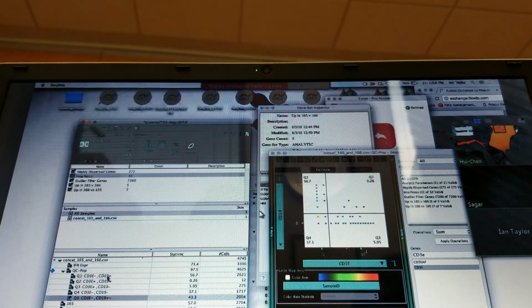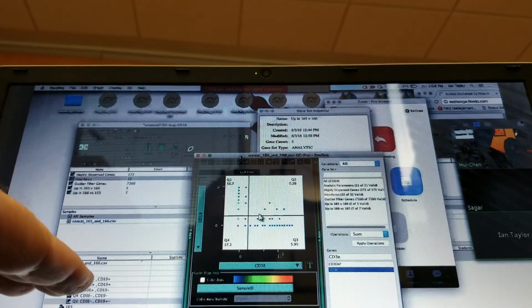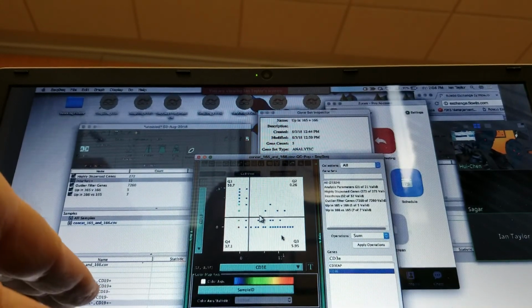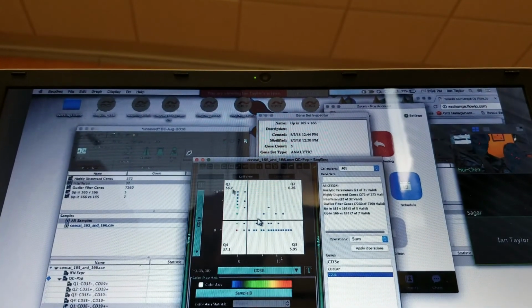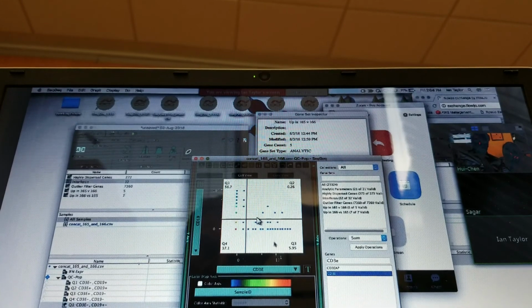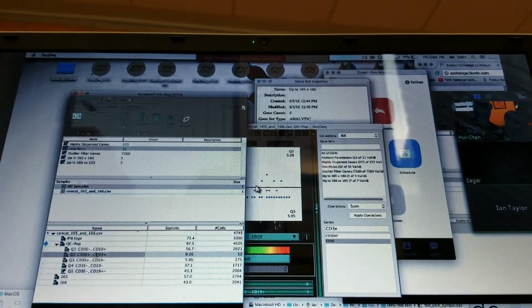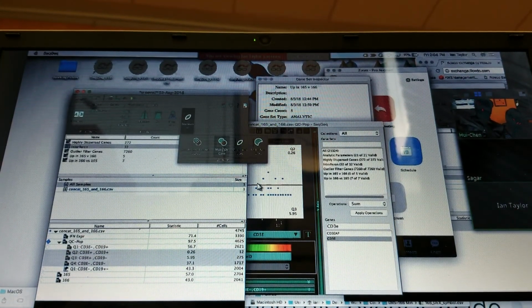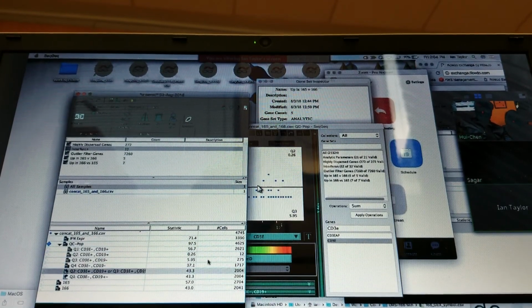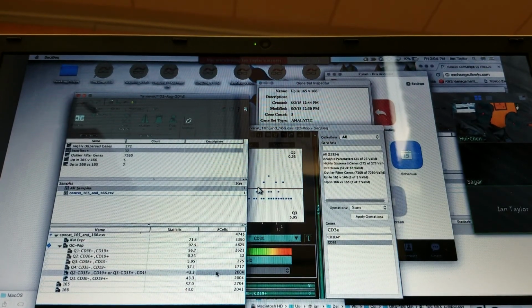Why can't you just do Q1? You don't need the NOT gate unless you need it. You got Q1 there. Q1 is CD19 positive. Right. The NOT gate is Q2 plus Q3 plus Q4. Oh, right, okay. And we could have done that. It's just a little bit more complicated because I would select these 3 populations, go to the Boolean option, and make an OR gate. Then we're going to get the same exact set of cells, 2004 and 2004. It's the same thing, just like that or that, right?